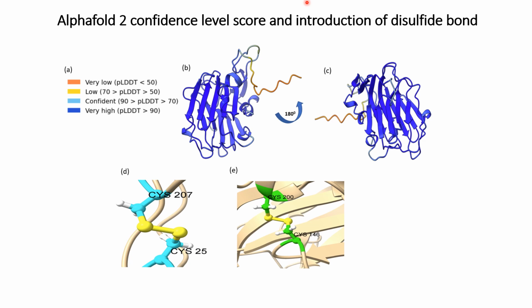However, previous circular dichroism spectral analysis showed that there are approximately 33% beta sheets in the aminopropeptide domain of collagen 11 alpha 1. From the structure we got from AlphaFold 2, we found approximately 32.7% beta sheets, which is very close.